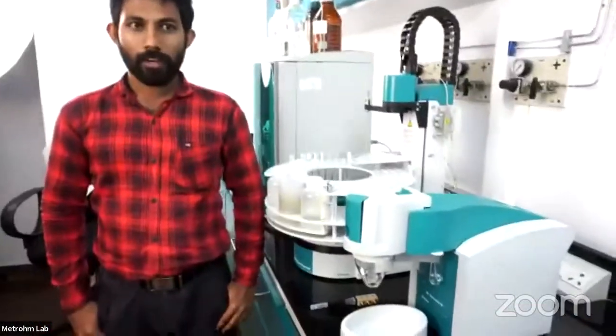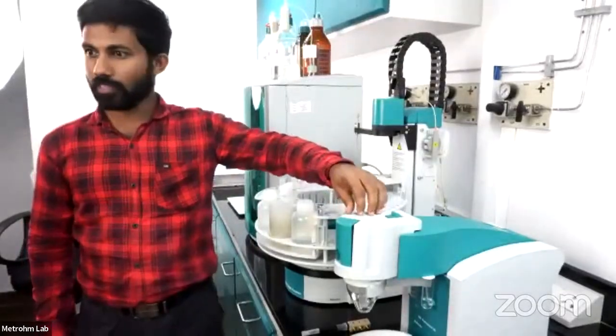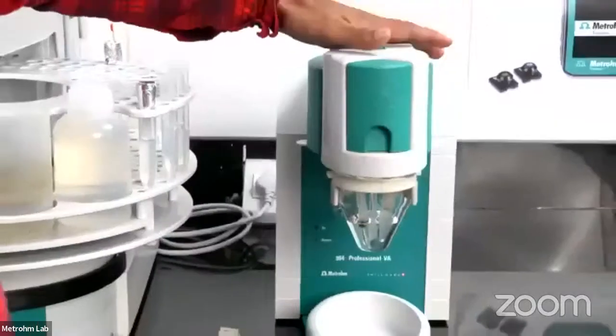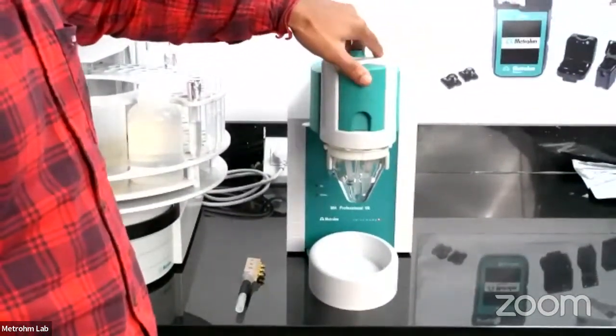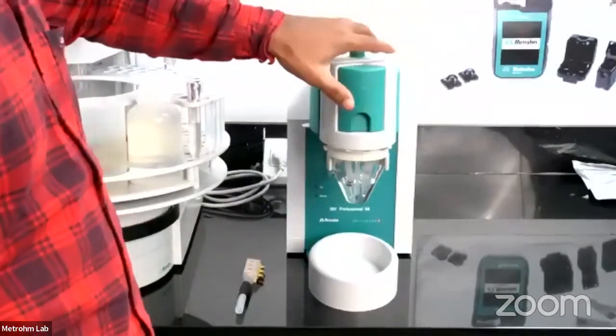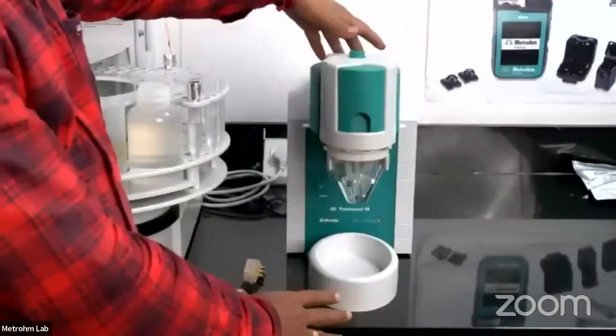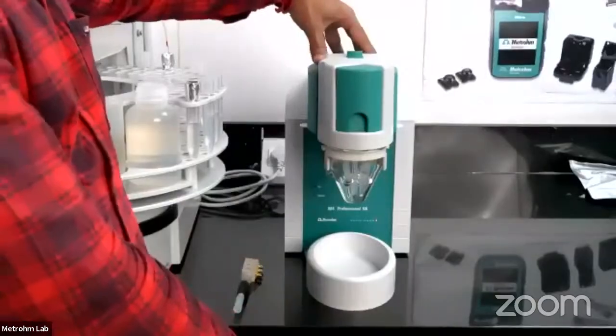Hi sir, once again welcome you all to the live demonstration of the 884 VA instrument. So this is the machine, the 884 Professional VA. It's also called a voltammetry instrument, or in other words, a polarography instrument. Basically, the outlook of this instrument is like this. It's a very small compact machine, about the size of an A4 paper.